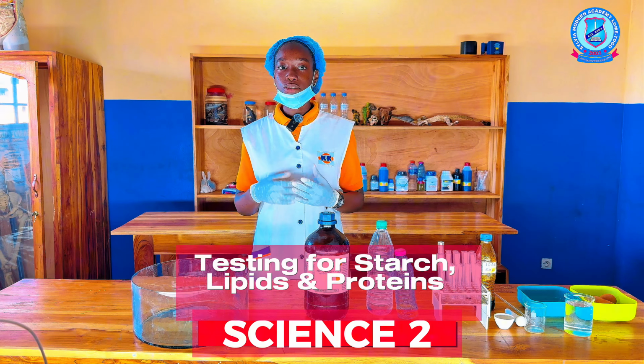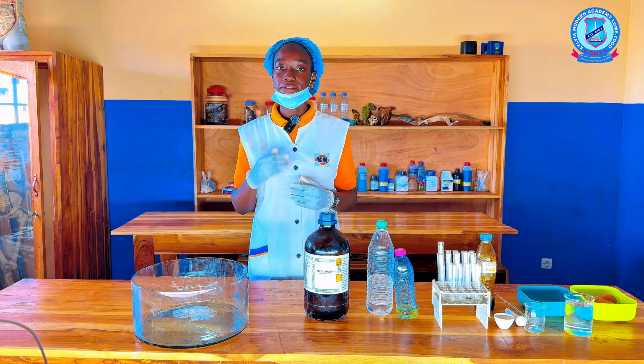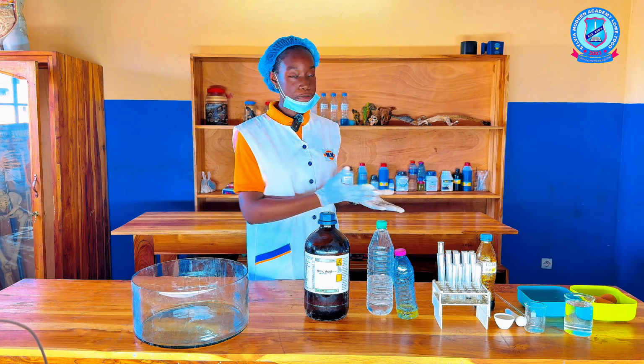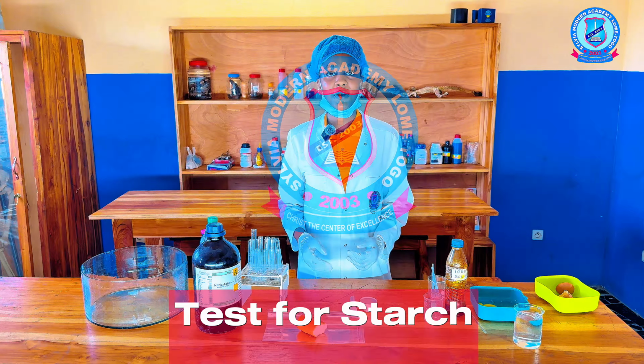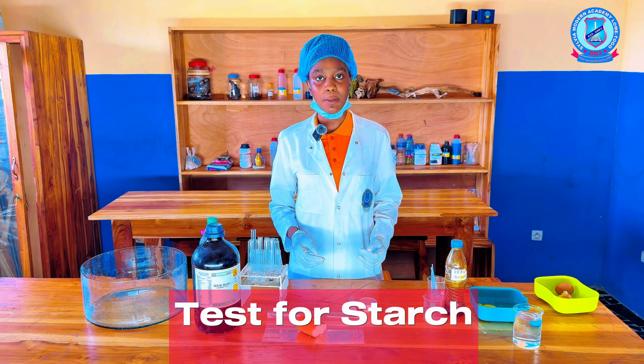Today, we are here to test for the presence of starch, proteins, and lipids, also known as fats and oil, in the given food samples. To perform the test for starch, we begin by collecting our bread sample.